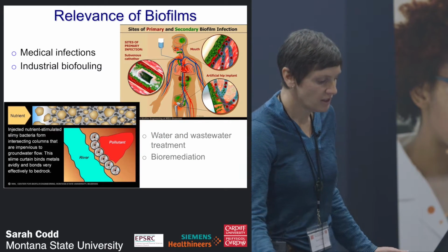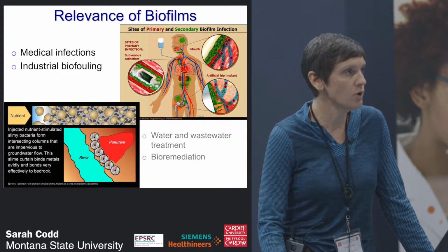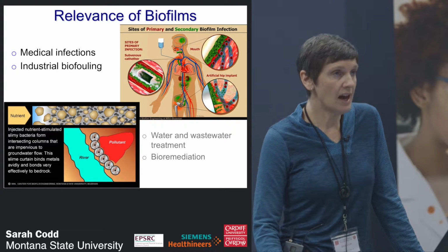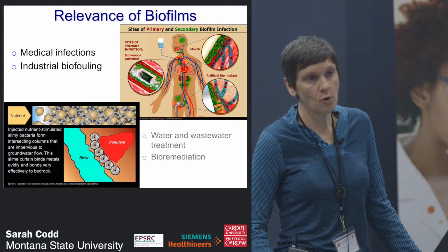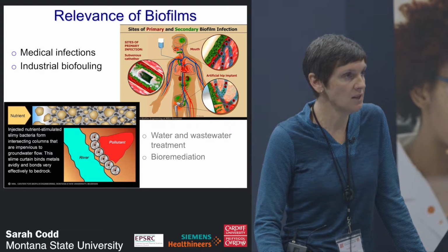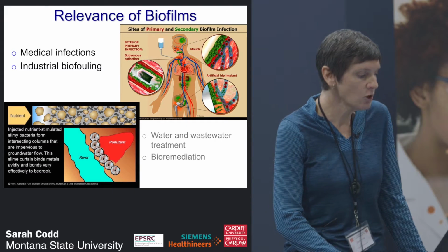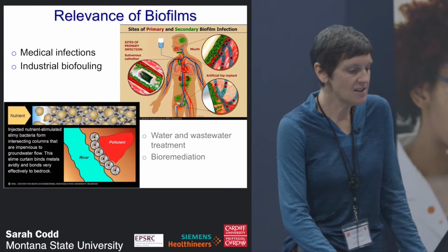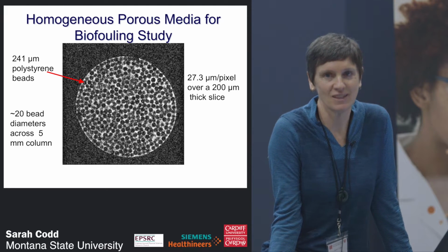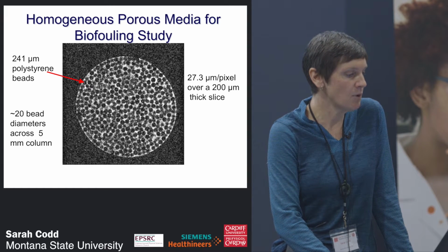So they're of course important because we want to prevent them in medical situations, but a lot of our colleagues that work with biofilms at Montana State are interested in them because they can be a helpful form of causing bioremediation by changing the state that contaminants are in so that they're no longer dangerous to the environment. So they're looking at trying to grow them in porous media. And so some of the first work we did was to come up with an easy to use porous media that fits inside the NMR system, so polystyrene beads. And we grew a biofilm within this polystyrene bead.